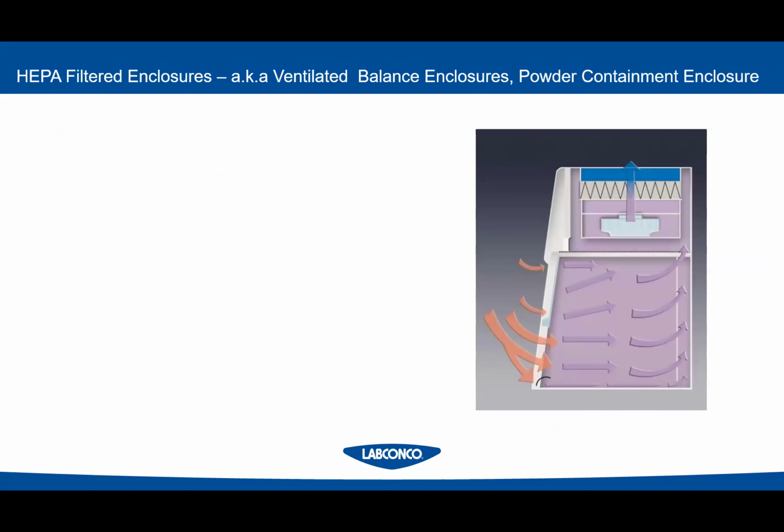All right, so what happens if we flip that fan the other way? Now we're going to start taking the air, moving it instead of down through the top and out, making that clean environment. We're going to start cleaning the environment that's in the enclosure with that HEPA filter and sending the air out the top of the unit.